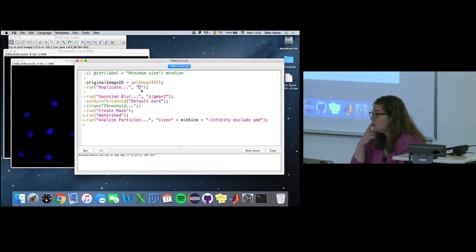And don't stress too much about how you're going to remember. She's just writing the code out, and you don't have to remember it. You've got the recorder, right? And I'm going to show you a cool place where you can search for the built-in functions in the ImageJ macro language. So you can always have that page open and record stuff. Just do it, record it, copy the code.